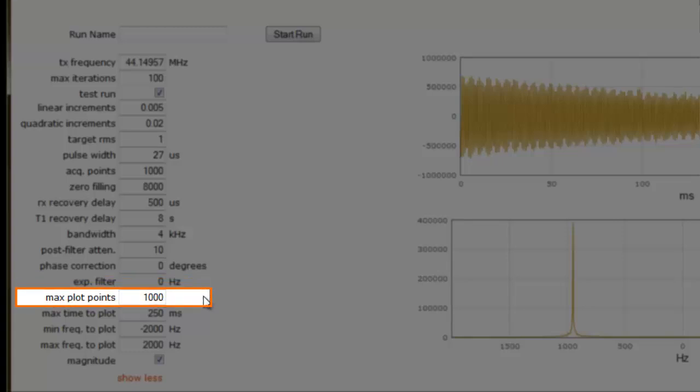The number of points we'll plot is 1000. This is equal to the number of points we're going to acquire. And since we're looking at 1000 points out of a 4 kHz bandwidth, the time of the FID we can acquire is 250 milliseconds.